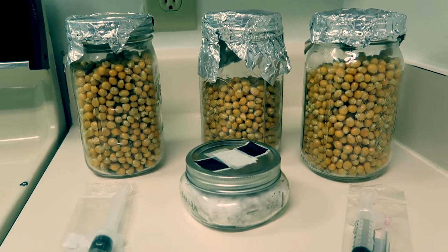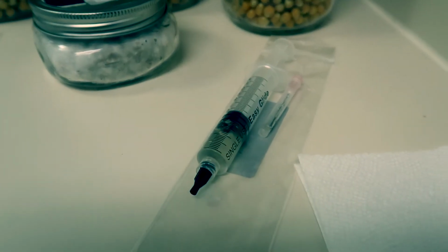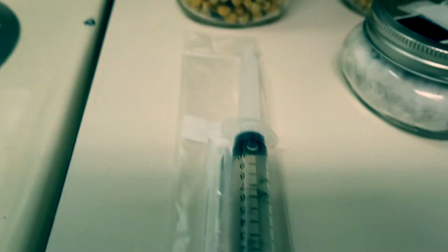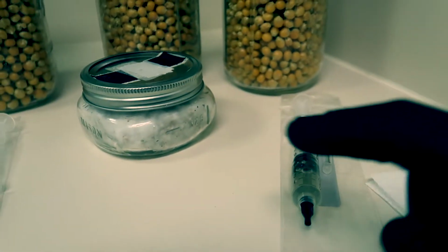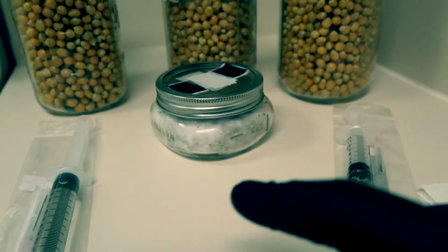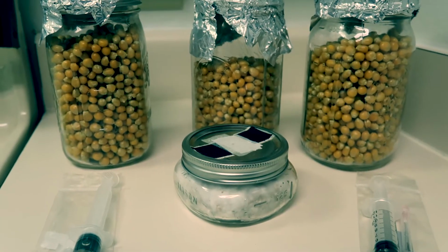Next up, I'm going to inoculate these 3 jars with 3 different inoculation methods. First one will be a liquid culture syringe, the second one will be a grain-to-grain transfer, and the third one will be a spore syringe. The spore syringe is going to take the longest to show anything because the spores have to germinate and then find another compatible spore and basically mate with it and all that good stuff to continue growing on into mycelium. And then the liquid culture and grain-to-grain transfers are going to be the next up to see which one is going to be fastest. But these are all different species and varieties of mushrooms, so we're still going to see different results in these 3 different jars.